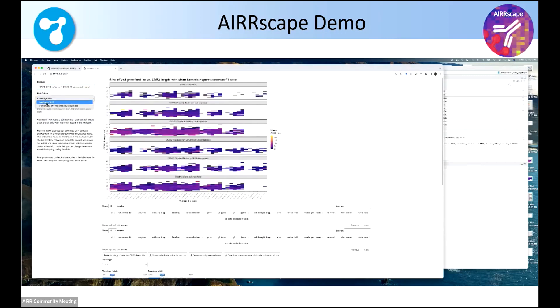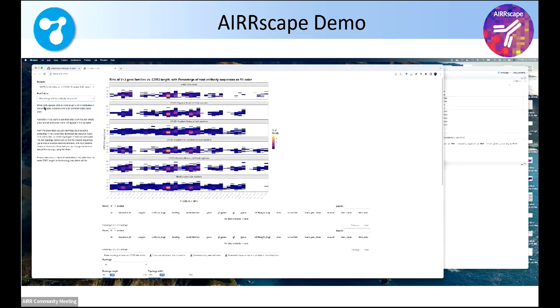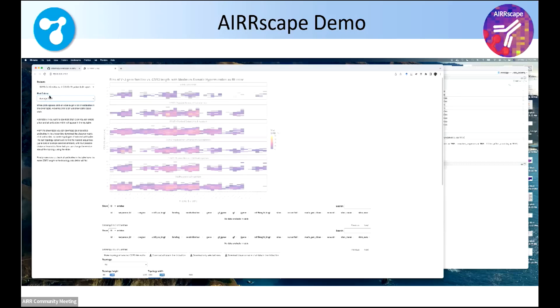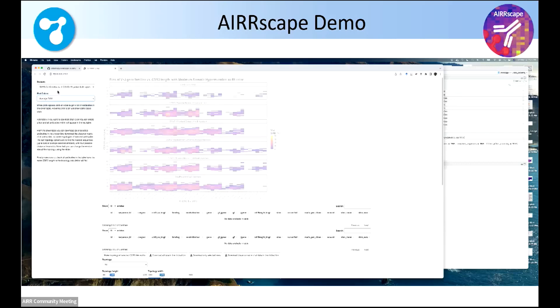The next place to look at is you can change the color scheme to be, so each bin, what's its average hypermutation, what's its maximum hypermutation. You can see the colors changing there, or percent of total to see what's the more common V and J genes.